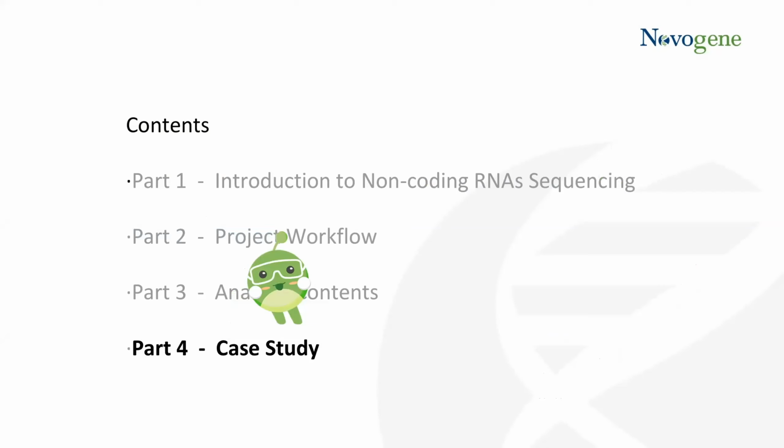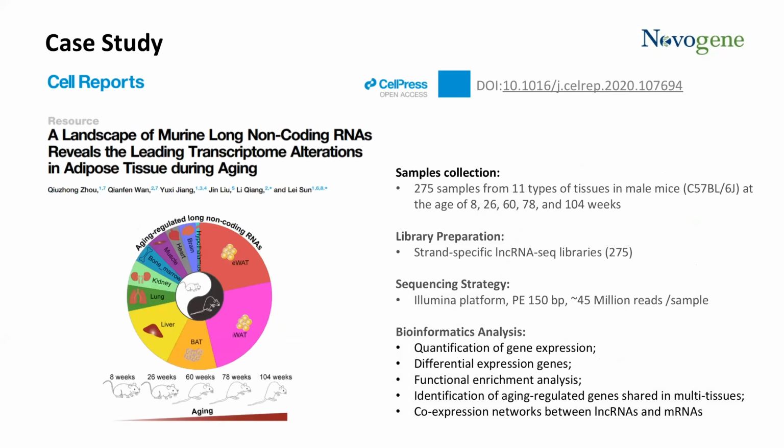The last part of my talk is going to show you a case study where researchers have used long non-coding RNA-seq to look at the effect on aging.